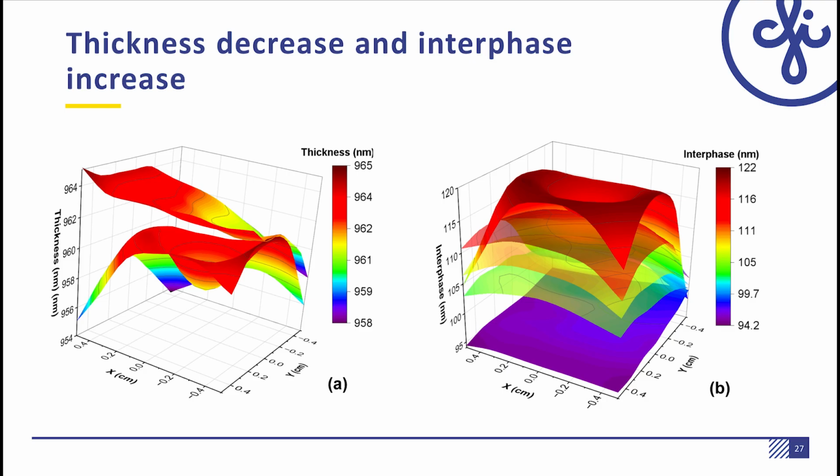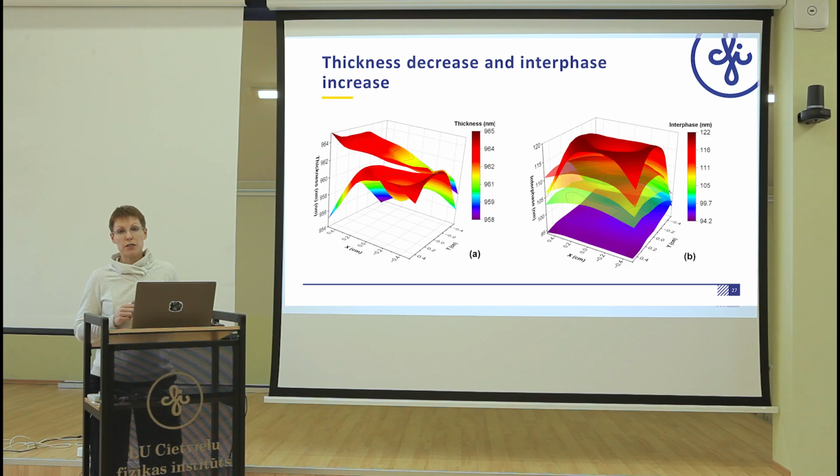There is a clear increase in the interface layer between the substrate and the film. And this interface layer is characterized with a lot of effective medium approximation volume of air. So practically this film is slowly detaching from the substrate. And when it is reaching the transparent state, this separation still remains there. And due to this fact, we see these circular areas in psi and delta scan over the sample, showing that, yes, our sample didn't reach its initial conditions.